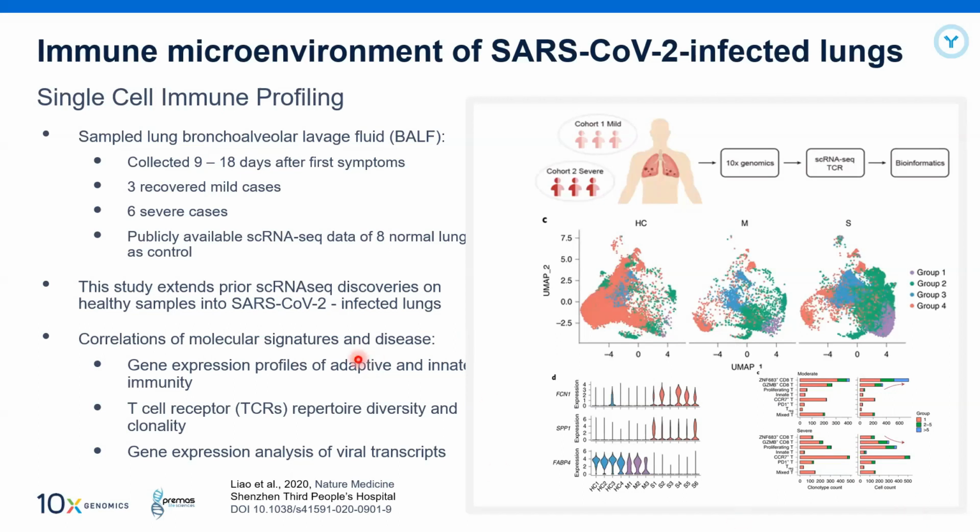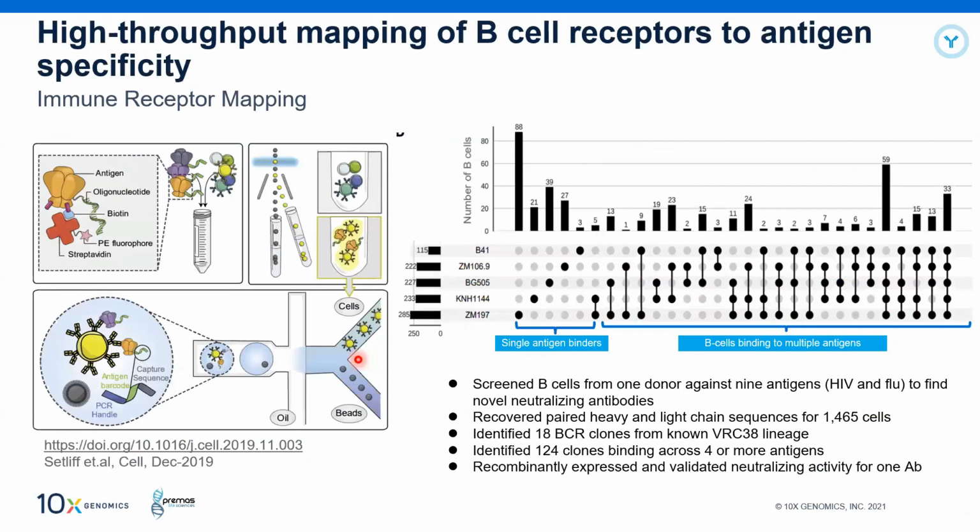Now, coming to the next slide, which is a very important one, I can say. I will try to explain it to the listeners. It's busy, but I'll explain it in a simple way. First, you see this particular one where you can see the antigen is there. There is a DNA barcode, there is a biotin and there is a streptavidin. So this is to purify those labeled cell populations.